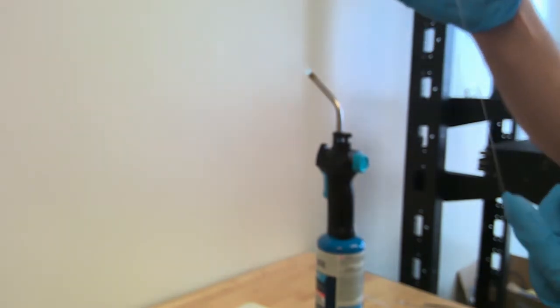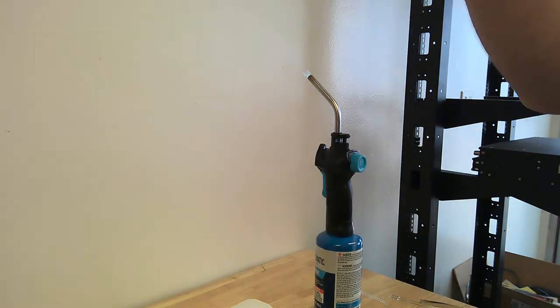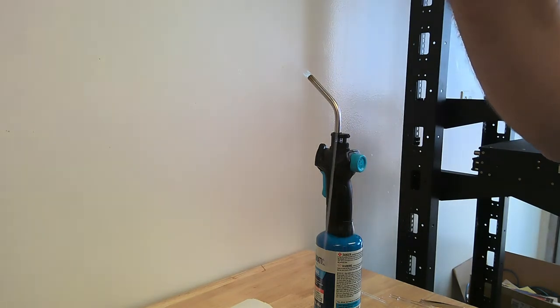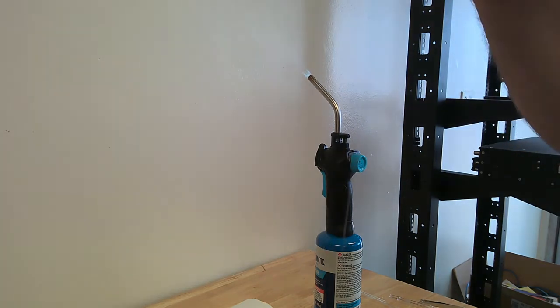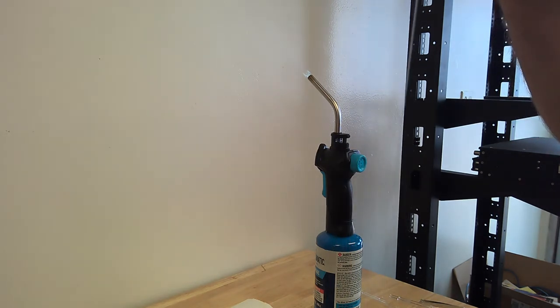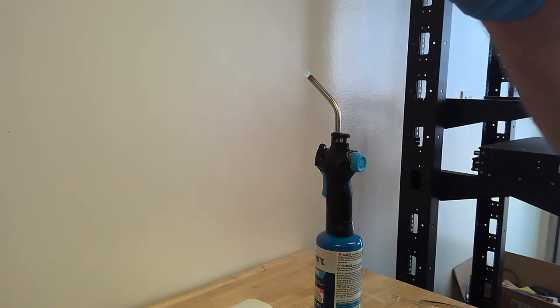Okay, so we have this long, thin piece of glass, and we're going to shape it into a series of capillary bells. To do that, we're going to break off a small piece from this long chain, and we're going to seal off one of the ends of this capillary bell. We need one end to be completely sealed while the other is open, so that we can collect a vapor pressure inside our capillary bell. When we're measuring the boiling point of a substance, we're going to be looking for the emission of bubbles from our capillary bell in order to indicate the boiling point of our substance.